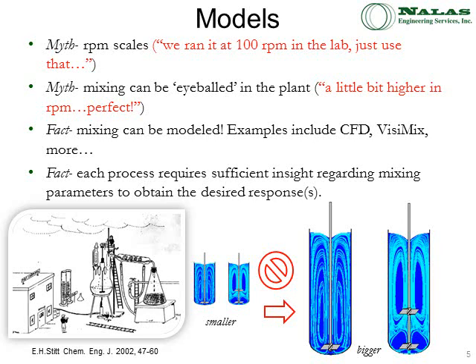So what I wanted to show you here is that what you run in the laboratory cannot be simply scaled up using the same round bottom flask. You've got to use the proper tools, such as the Optimax system, such as the VisiMix software, to get you to that commercialization.